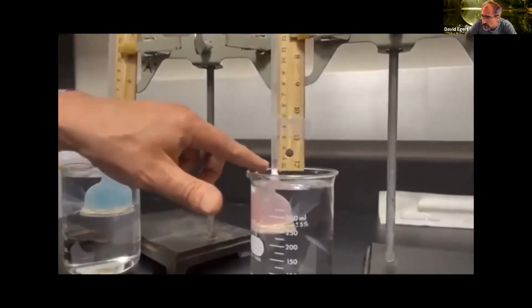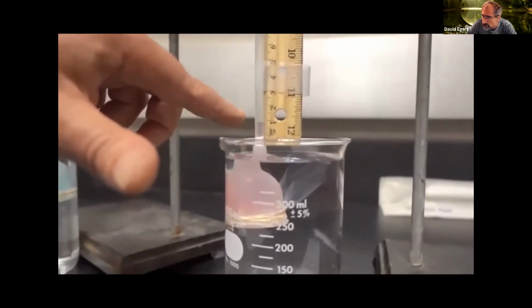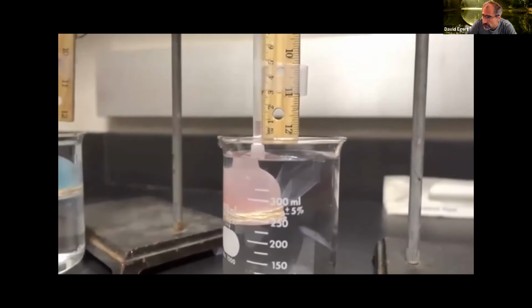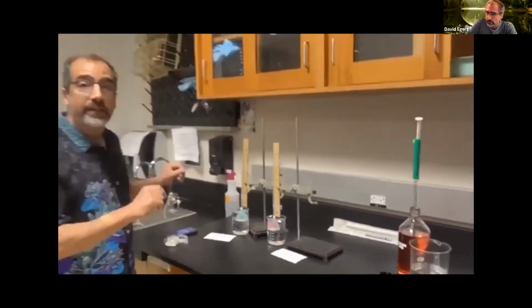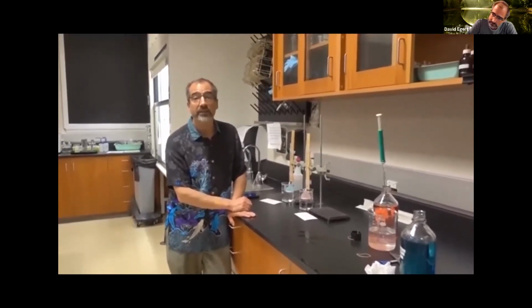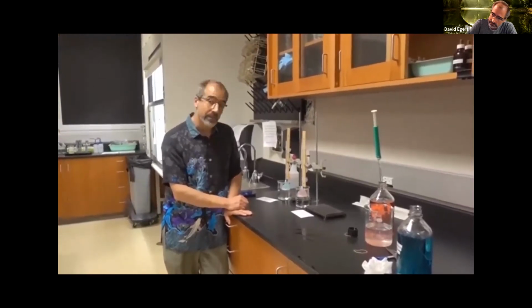Over here, much less height was gained, only about 8.5 millimeters. I write that down in my data in my lab book, then keep the experiment going and take the next data points at 20 minutes, 30 minutes, and 40 minutes.